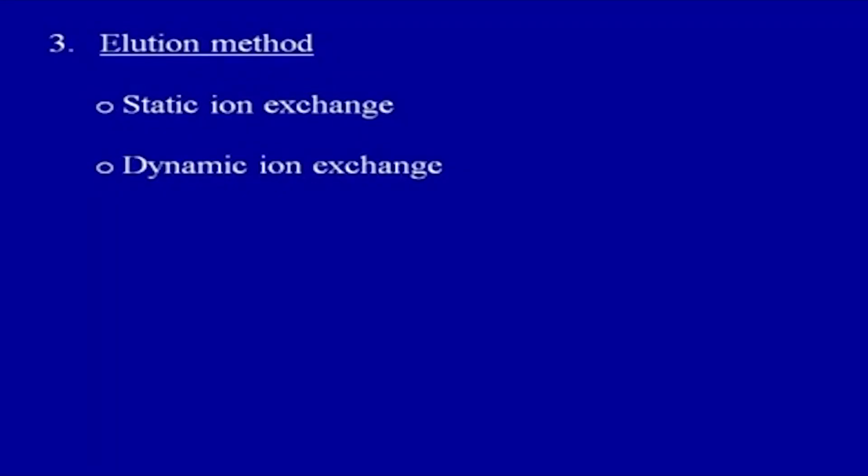Rather than batch adsorption, you can also do it in column adsorption. In batch adsorption, a protein is purified by adsorption of contaminants, which allows the desired protein to pass through the column without binding. Now, no concentration of protein results in here, unlike in column binding. Rather than batch mode, you can also do it by elution method.